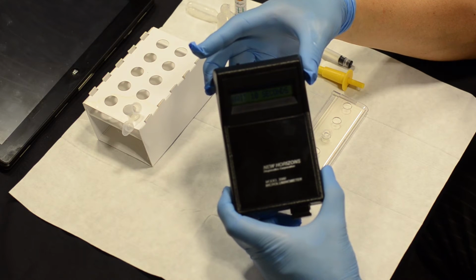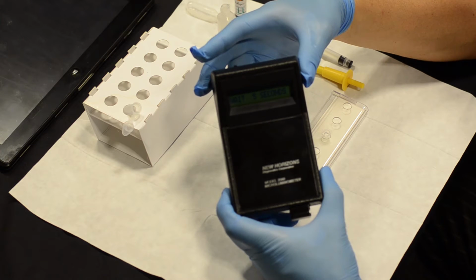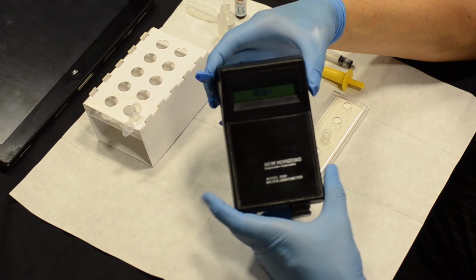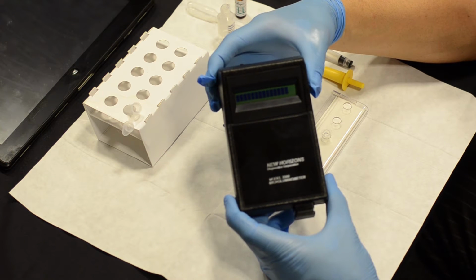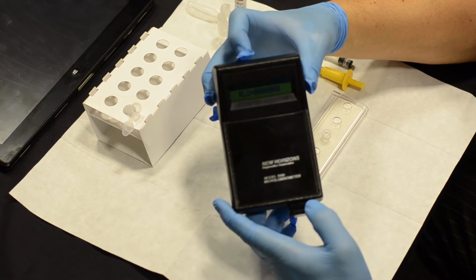It will then tell you on the screen to wait 10 seconds and count down until it's ready. A simple test to ensure the machine is working is to open the drawer and then close it again and allow it to do a test with nothing in the drawer. It should come up with a 0 count of relative light units. Now you see 0, 0, 0, 0. So that's the machine is working. You can then turn it off.